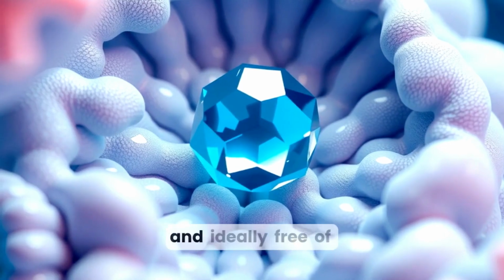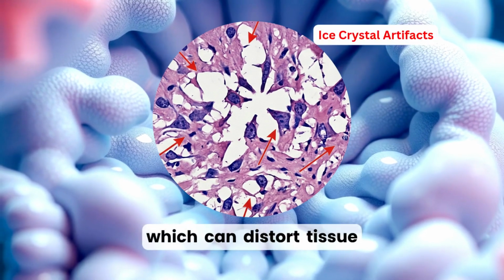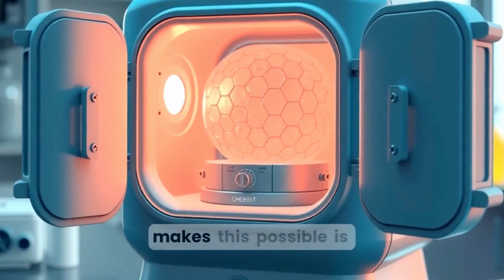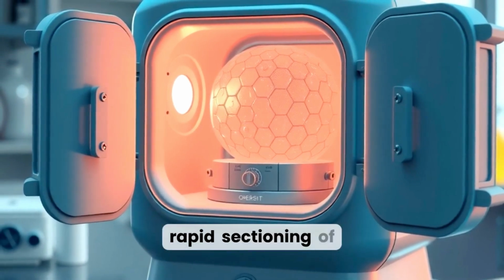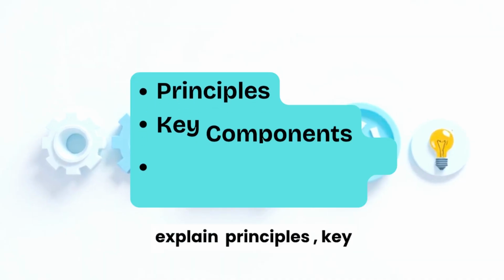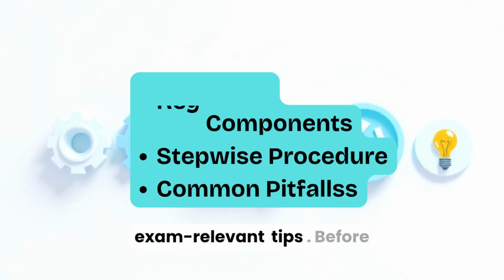Sections must be thin and ideally free of ice crystal artifacts, which can distort tissue architecture and obscure diagnosis. The instrument that makes this possible is the Cryostat, a refrigerated microtome designed specifically for rapid sectioning of frozen tissue. In this video, we will explain principles, key components, the stepwise procedure, common pitfalls, and exam-relevant tips.